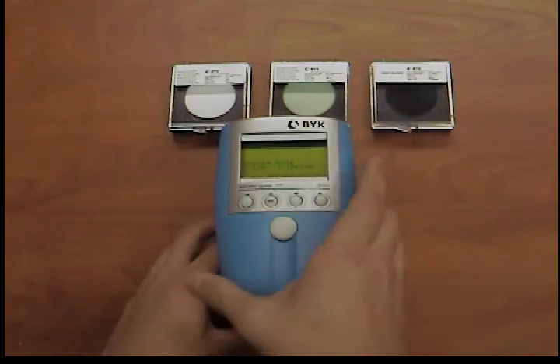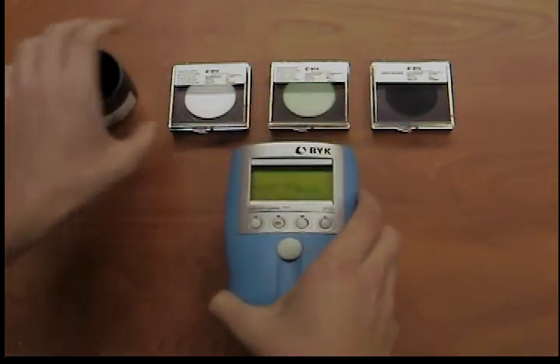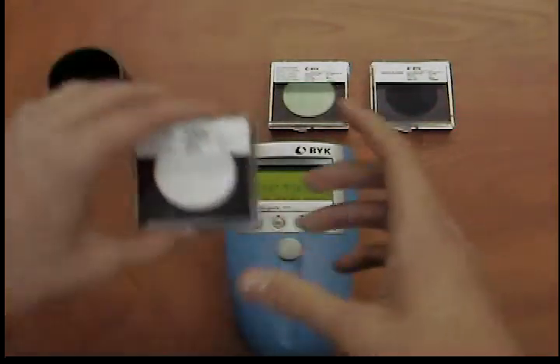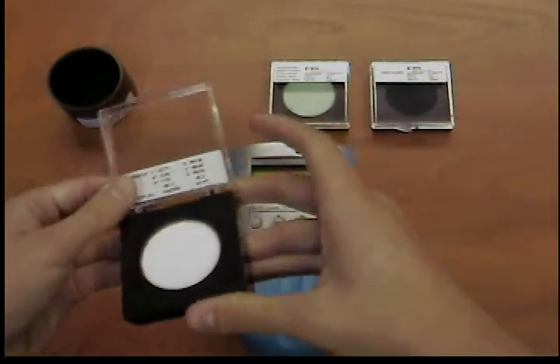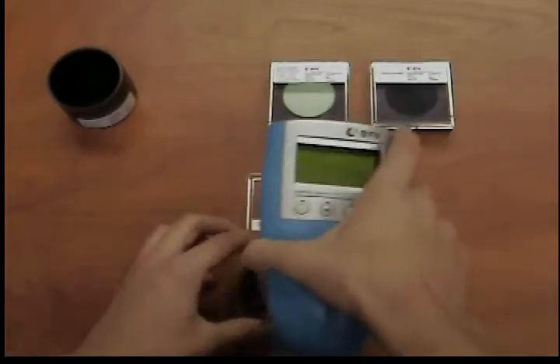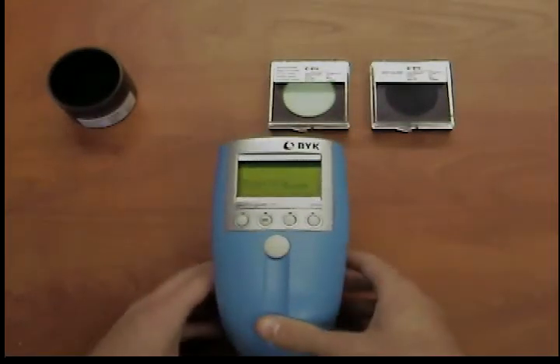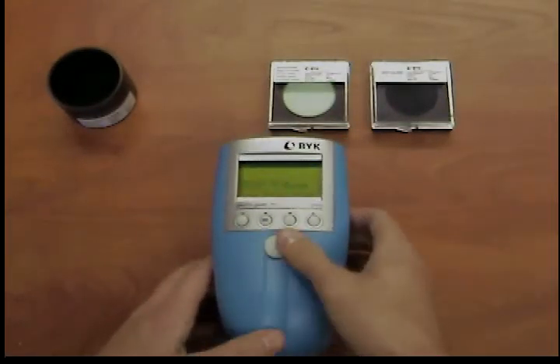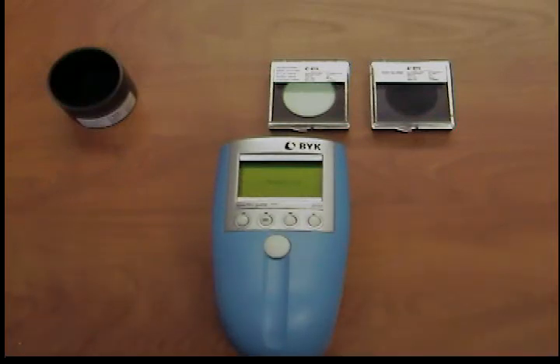Now lay the white standard with the displayed standard number under the instrument and press the operate button again. A beep will again indicate that the measurement is complete.